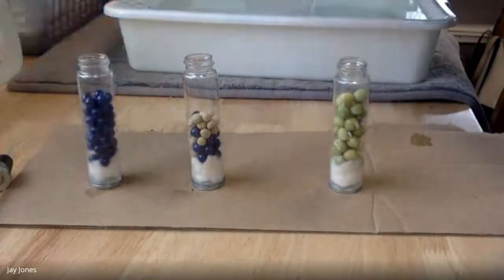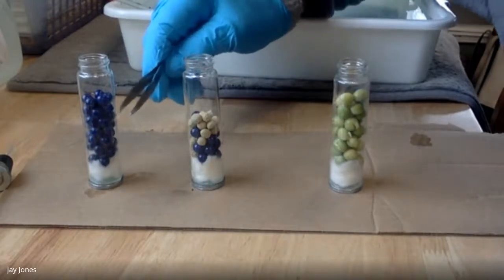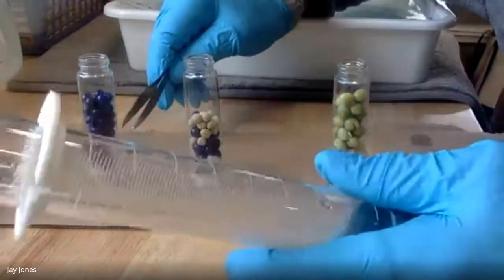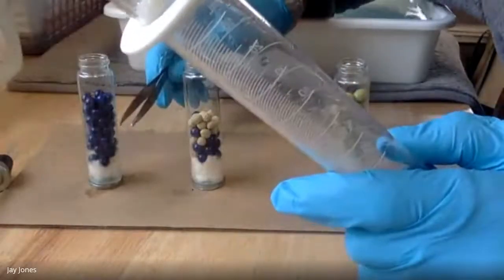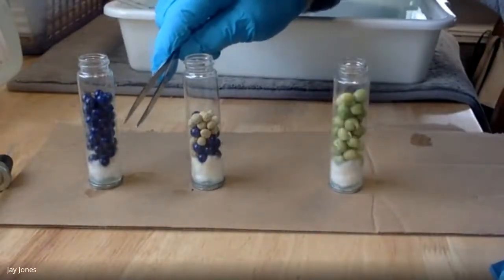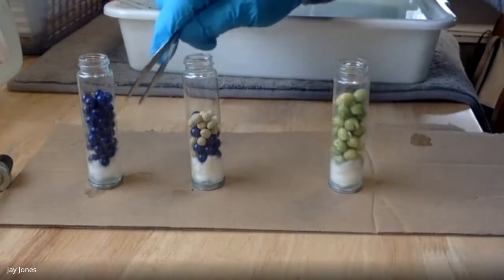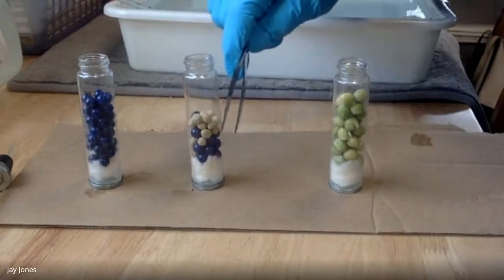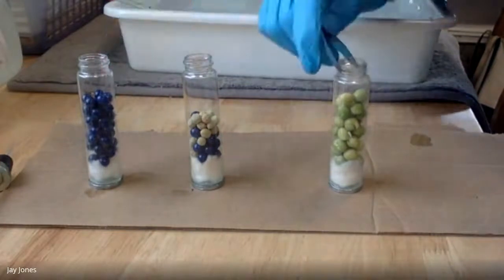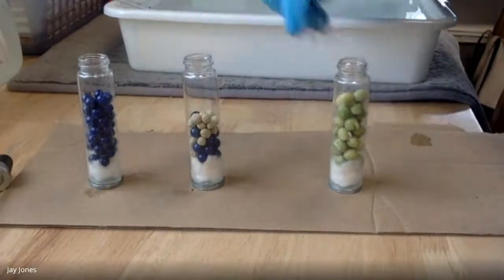And lastly, over here, we have X number of beads. I don't know how many it is. I don't care. What I do care is that it's 10 mLs of beads. I filled water to 50, dropped the beads in, and it rose to 60. So there's 10 milliliters, or 10 cubic centimeters, of beads, basically the same volume that this displaces and this displaces. So each of these is the same volume. Isn't that nice? I'm controlling for volume.